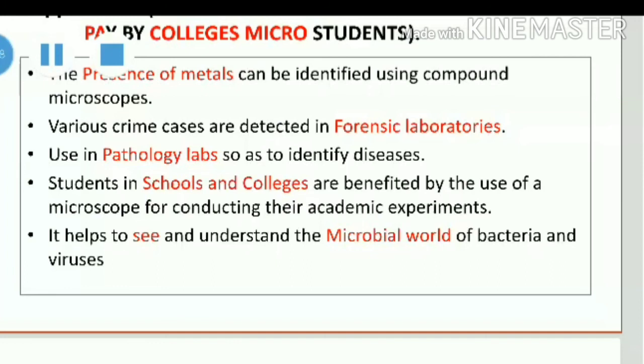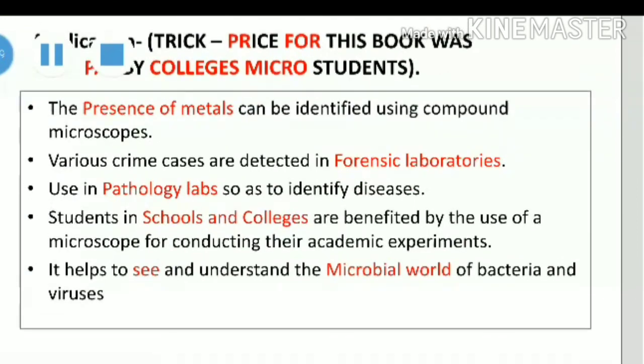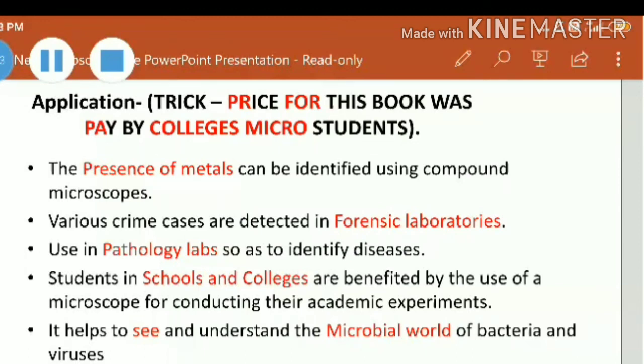Next, students in schools and colleges benefit from the use of the microscope for conducting their academic experiments. It also helps to see and understand the microbial world of bacteria and viruses. We can recognize this by a simple trick. Price for this book was paid by college's micro students. In this way, you can simply recognize the compound microscope. You can also elaborate the parts and functions of microscopes.